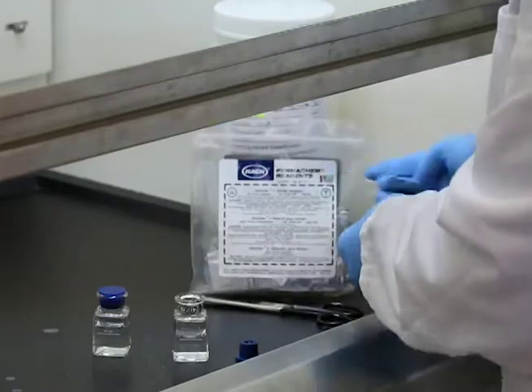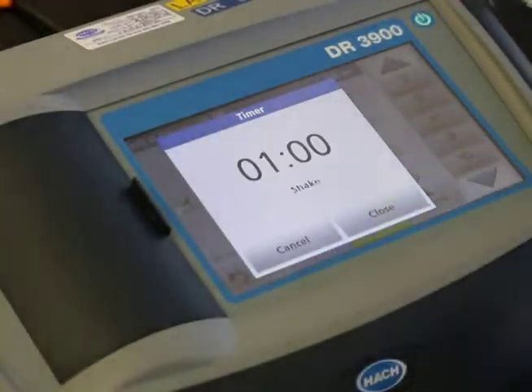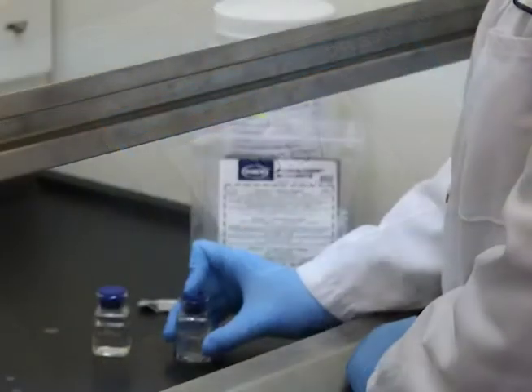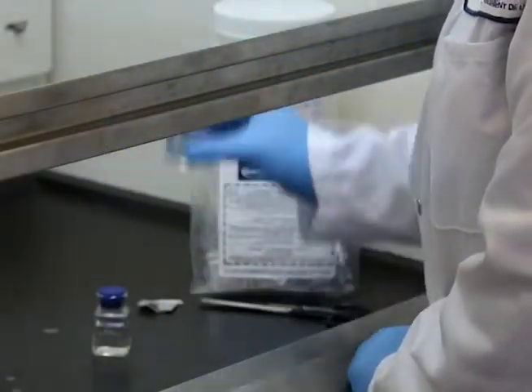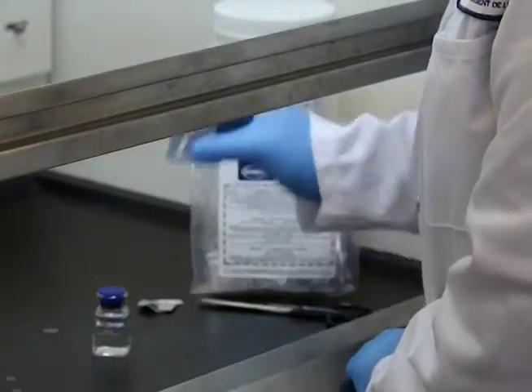Add the contents of one NitraVer 5 reagent powder pillow and start a 1-minute timer. Stopper the cell and shake it vigorously until the timer expires. Some powder may not dissolve and it will not affect the results.